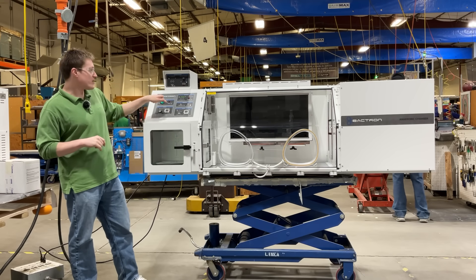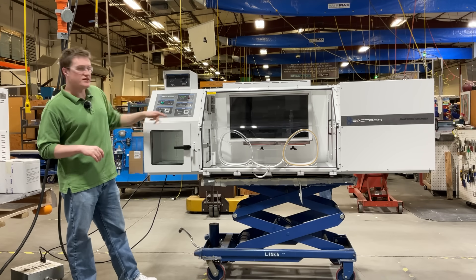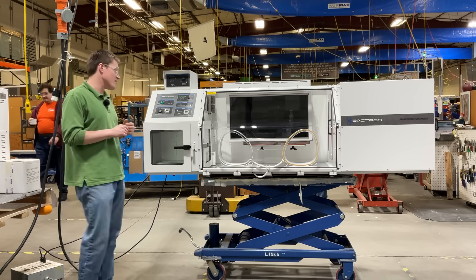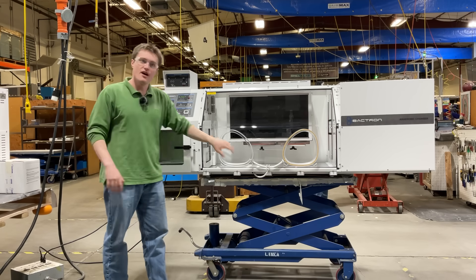Below that, we have the airlock and sleeves. Both of these feature digital pressure gauges and are basically your control center for the pass box and your sleeves.